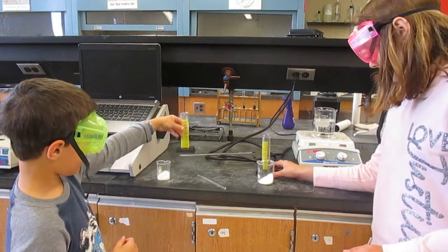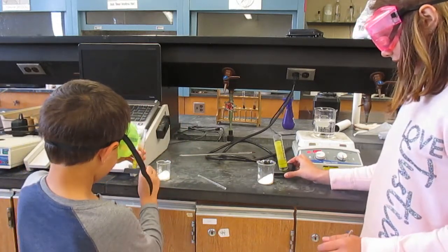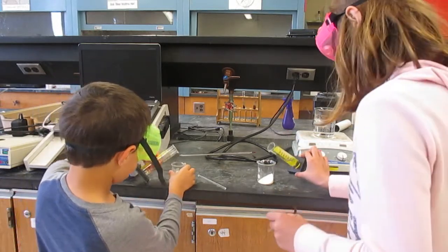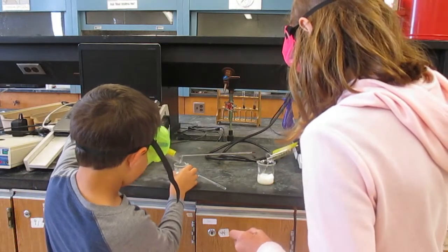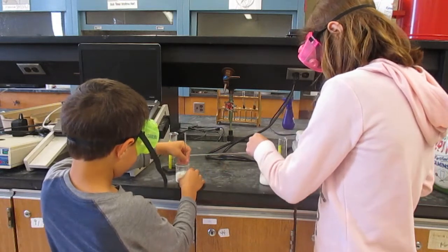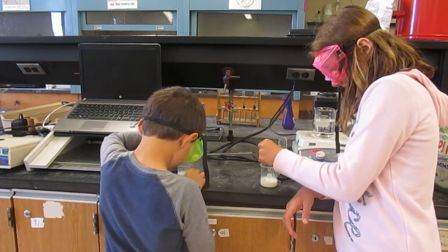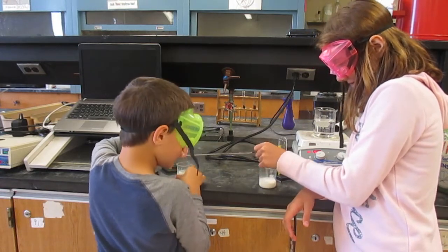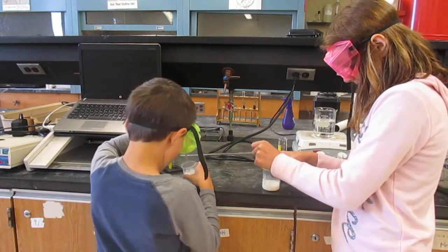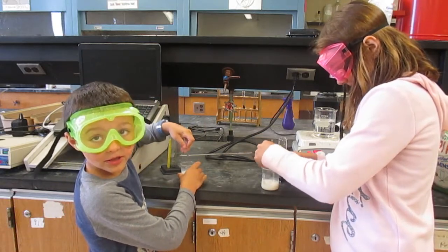Okay, so now we're going to put the 20 milliliters of warm water into the dry milk and then stir it till it dissolves. And what color do you think it's going to turn out to be? Definitely white. Because what's the color of milk? White. That's exactly right. So you're going to stir this until what? Until all the powder dissolves. But the color of the solution will probably be what color? White. It's going to be milk, yep.